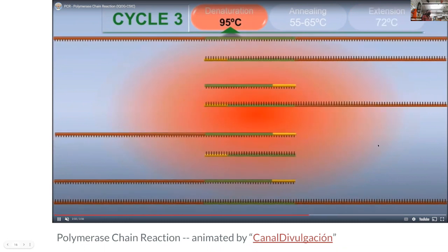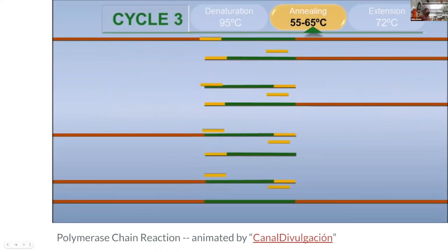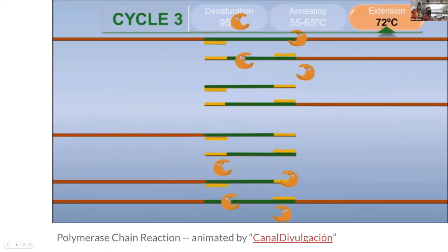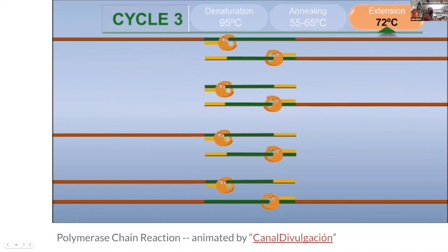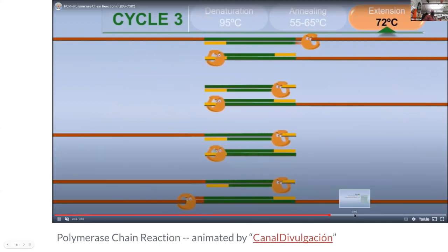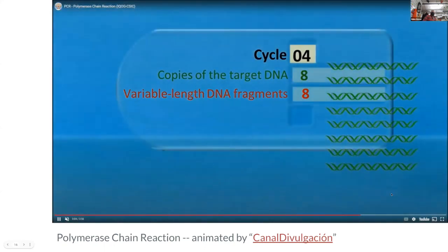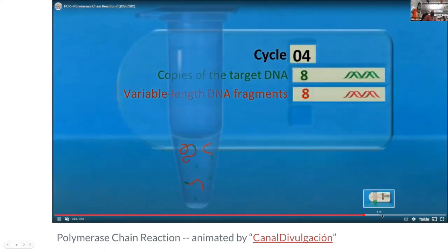This is how we could go through and find the DNA of coronavirus in a PCR test, because you can make lots of copies of your DNA in there, and you'd be able to see sort of how much of that you've got. So then after these cycles, this is exponential. So you definitely get a doubling of what goes on.